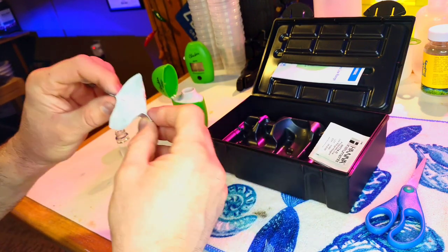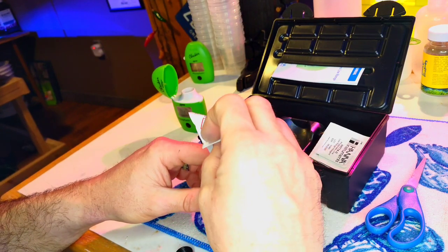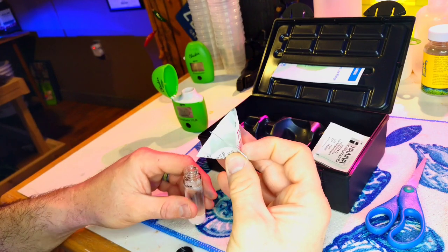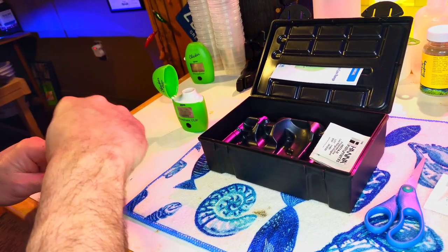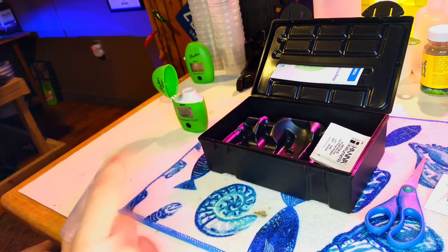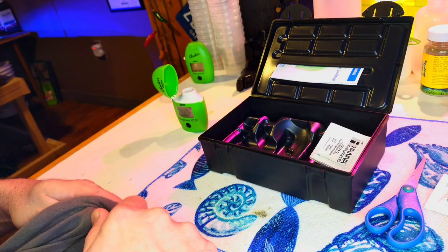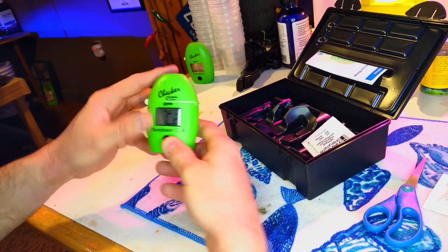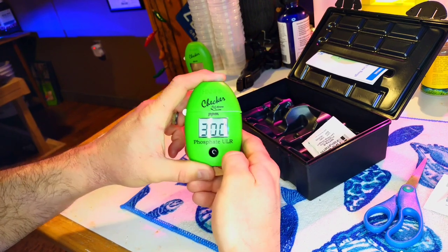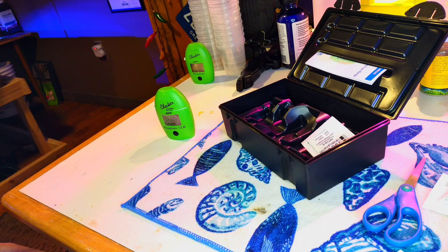This reagent is sort of like a powder — almost like fine-grade salt. We're going to shake it up, then wipe the smudges off again. The only difference between this one and the alkalinity test at this point is you're going to hold the button in and it'll do a countdown — a three-minute countdown. So go do what you need to do for three minutes, come back, set a timer, whatever you have to do, and it'll tell you your reading.